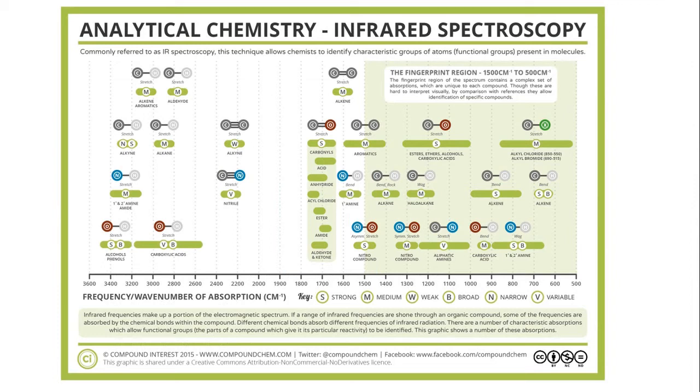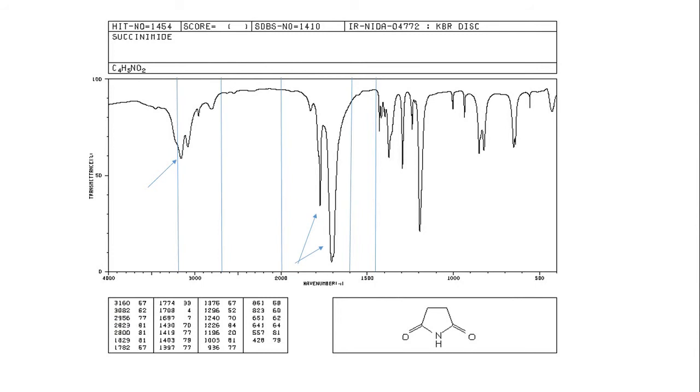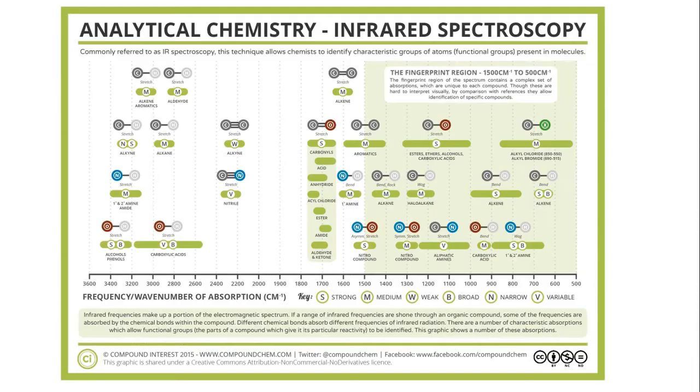So that one main peak, at the end of zone 1 that's on the edge of zone 2, looks like it is probably an amine. It's got that nitrogen to hydrogen bond right there, and then it could also potentially be an alkyne, or even an alkene or aromatic or something like that right on the edge there.